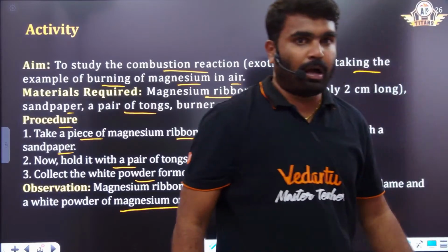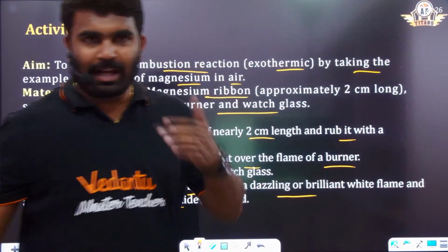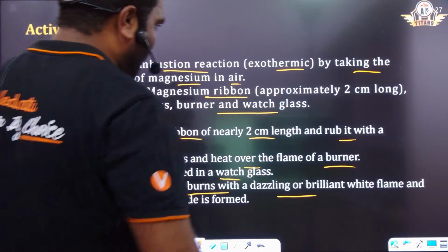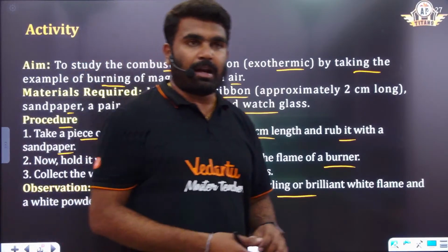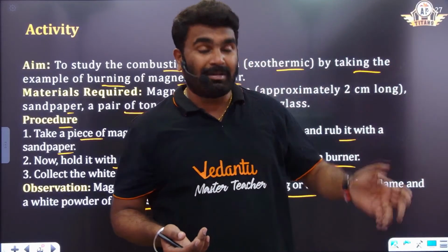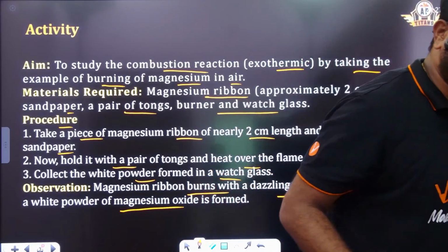Okay, so now agarbatti, I don't have agarbatti actually. We cannot do it with agarbatti. I tried with paper and I tried with this cardboard also to burn it, but it is not happening. I tried many ways, but it is not happening.